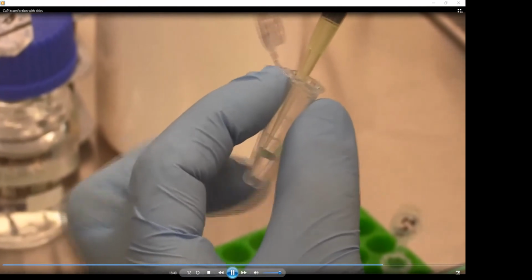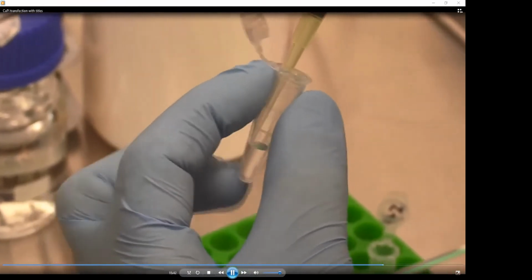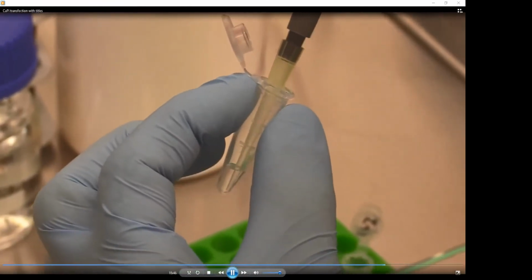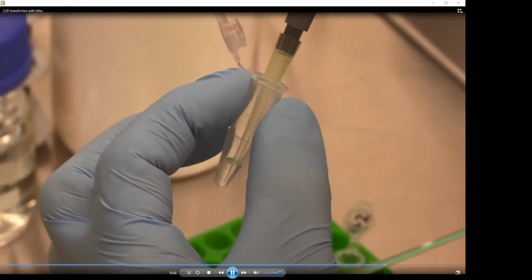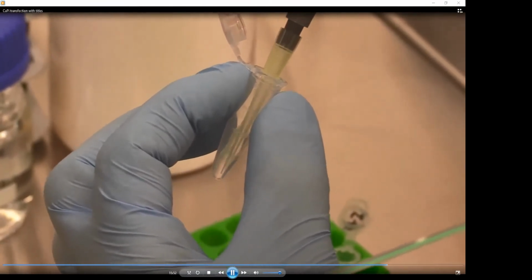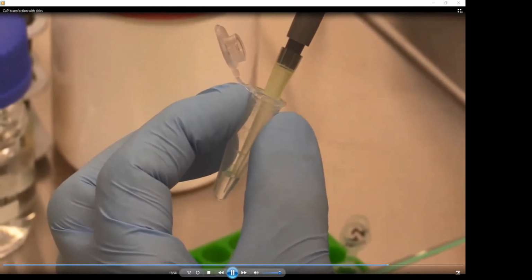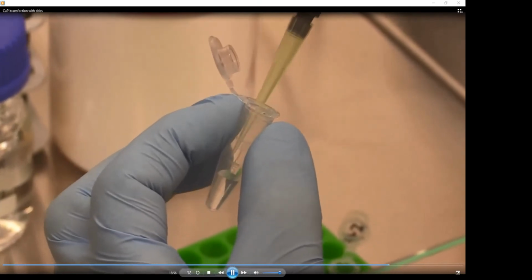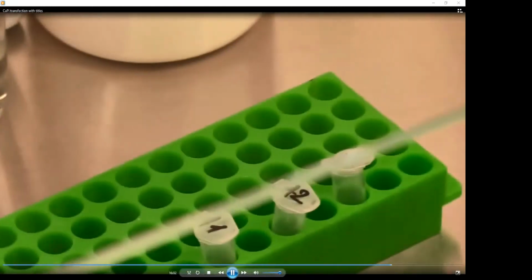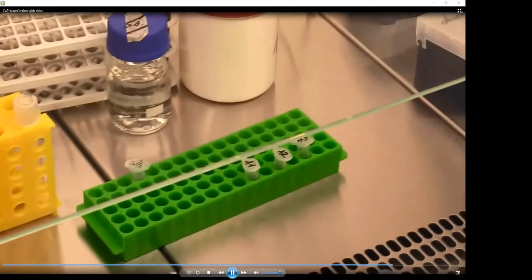Important is that you follow the protocol. So it may be a little bit annoying that you see this step several times, but I have already cut the video to make it a little bit faster than the reality. But you see the most important steps several times, so that gives you the feeling how it would be if you do it yourself. Next time, if you do it in reality, you will be better prepared.